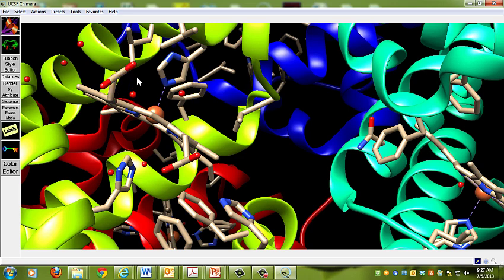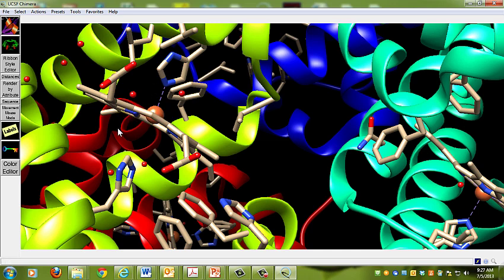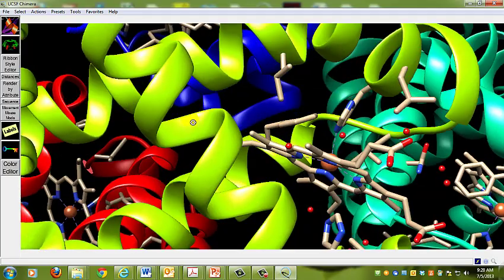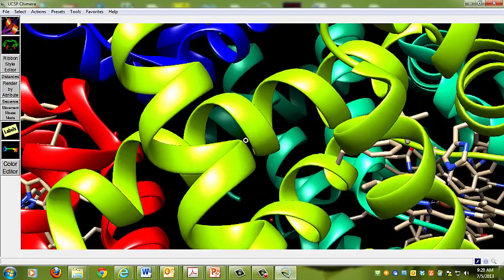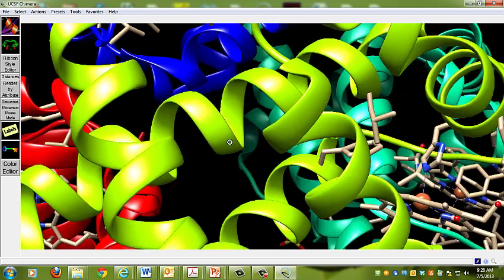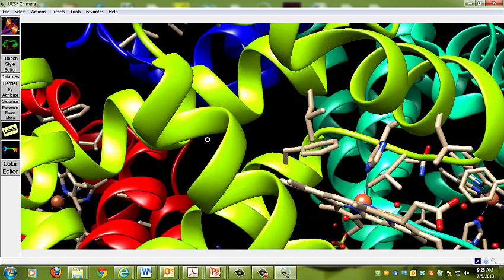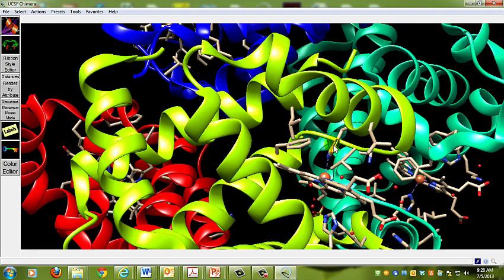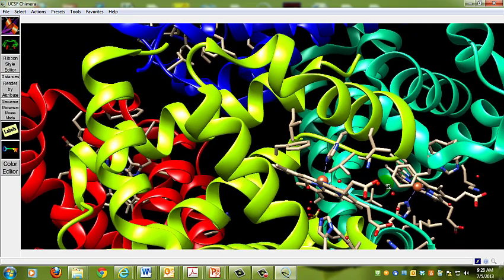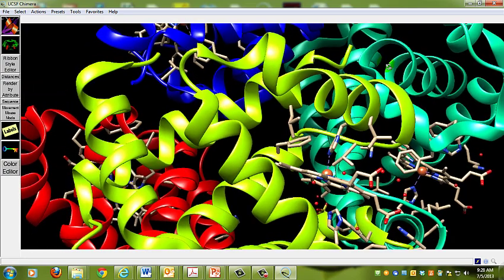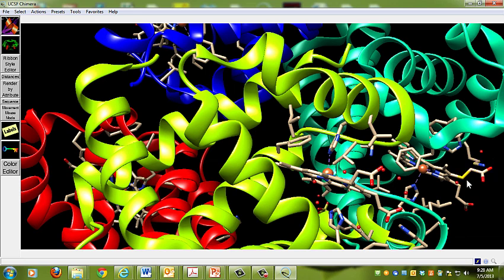The little red balls you see in your picture are actually water molecules. They don't have the hydrogens added, which would add white and make them slightly bent. To keep some things simple, instead of having hydrogens on these rings here, we don't fill them in.